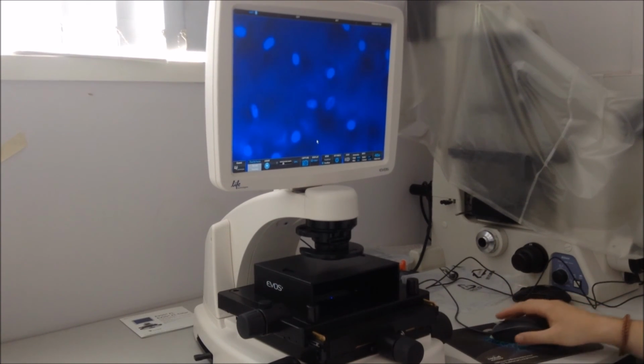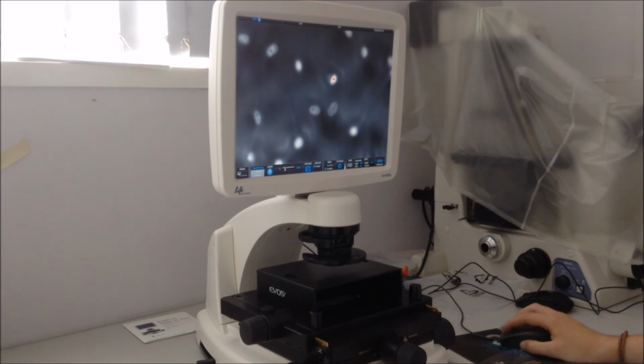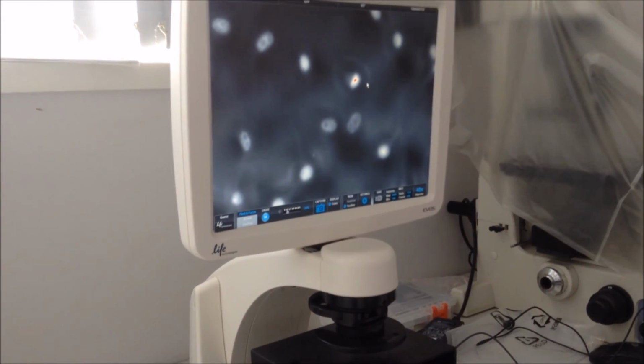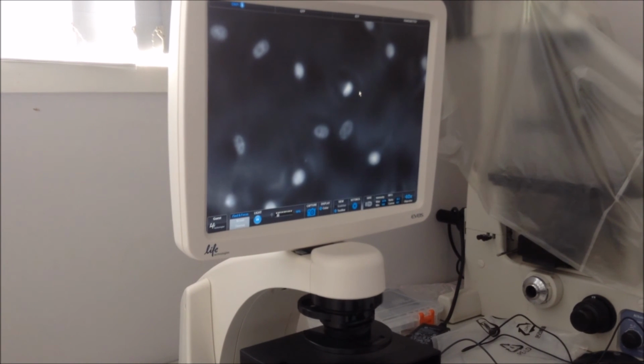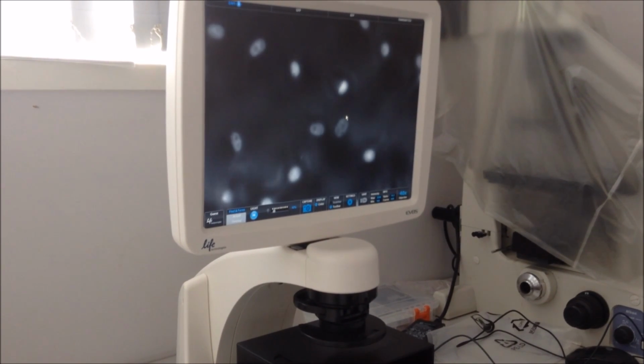Another feature is the ability to grayscale the image. When you grayscale, you can also get these little red patches that appear in your cells, and these little red patches indicate overexposure. To get rid of these, you can just change the brightness lower, which can then correct this issue.